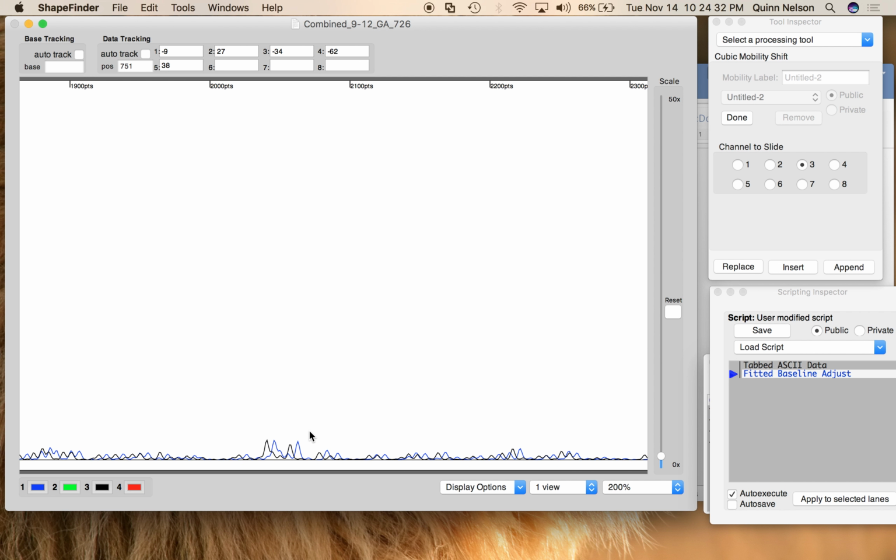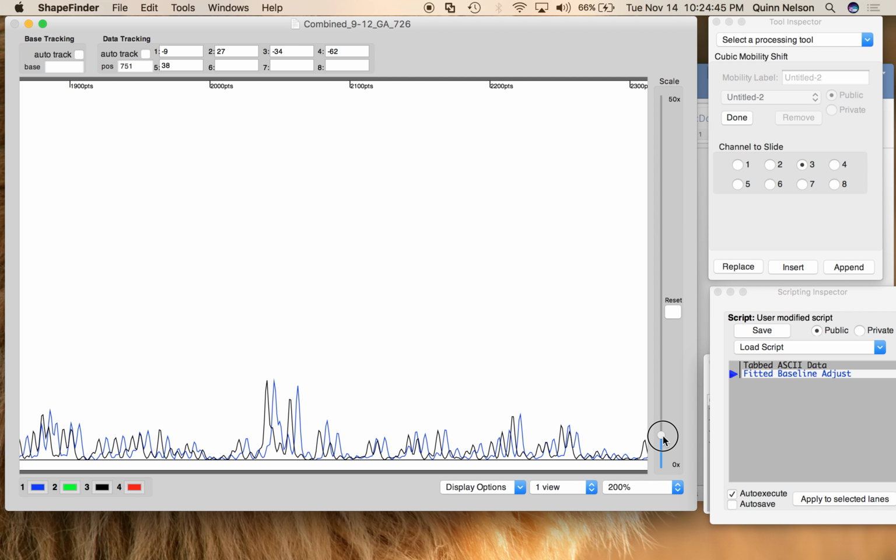Okay, now everyone stop and look up at the video. Right now these peaks are really small, and you're like, well, hey Quinn, I don't want to strain my eyes. And I'm like, I have a solution for you. So you take this scale and you jack it up. Okay, now all of these peaks just got bigger. That's okay to do. It doesn't influence the data in any way. It just displays it a different way so you can align it better.